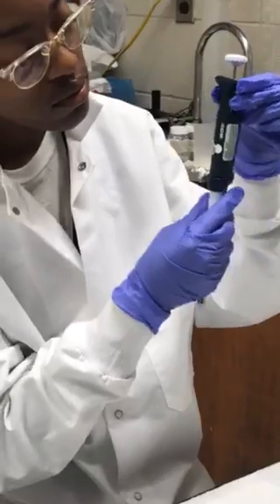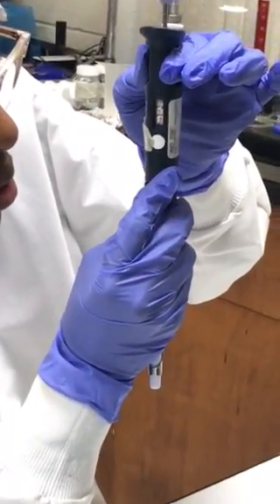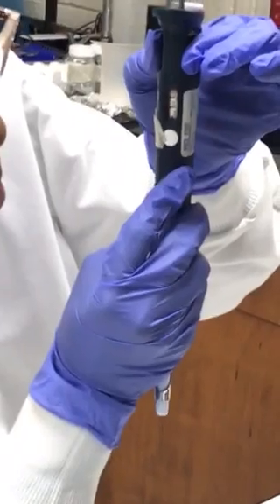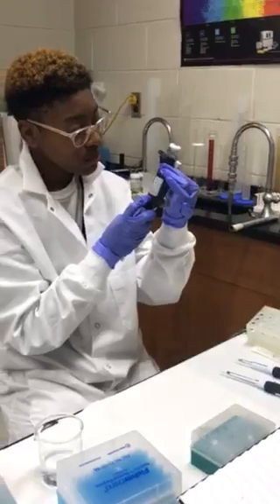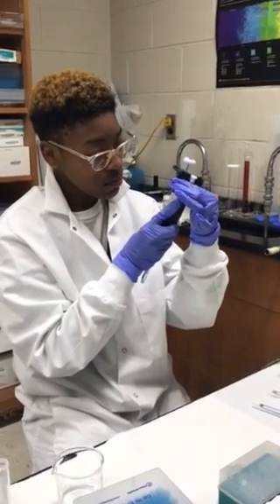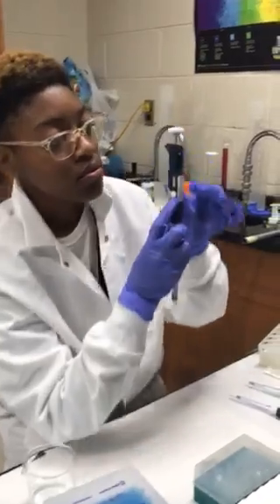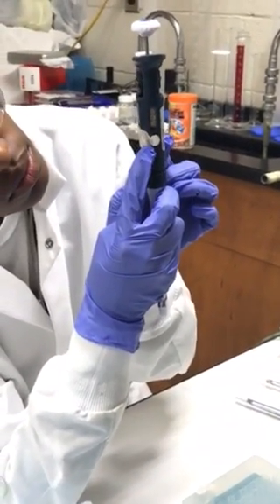The dashes in the third number box indicate even numbers. The space in between the dashes indicate odd numbers. For example, using a P1000 pipette, setting 552 will be displayed as 055, and the first dash to the left of the 5 is 2.